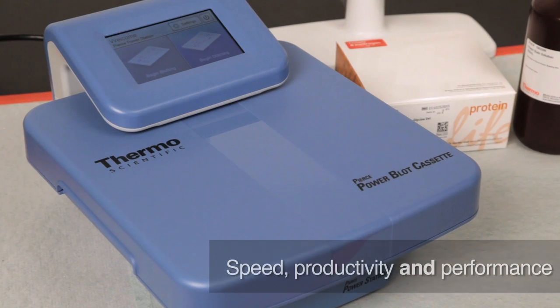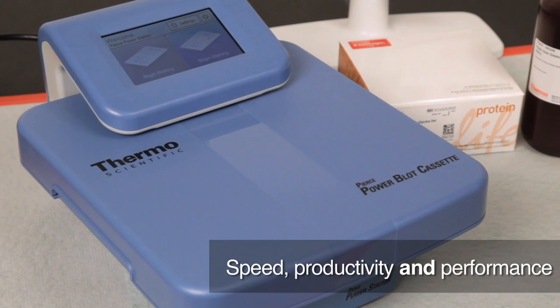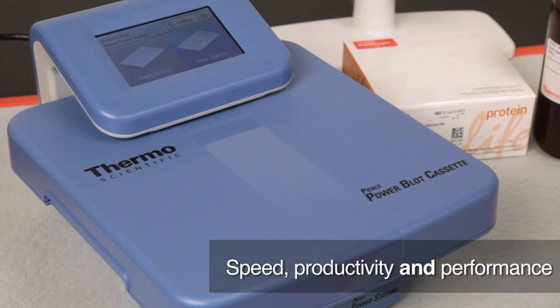With traditional Western blot analysis taking one day or more to complete, the Pierce Power Blotter is designed to deliver speed and increase productivity without sacrificing performance.